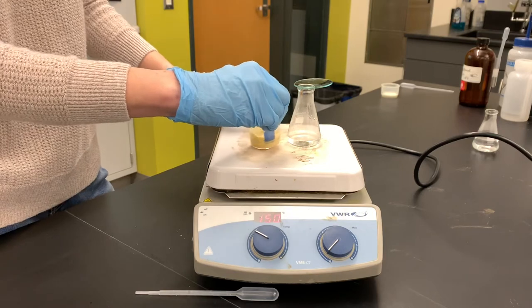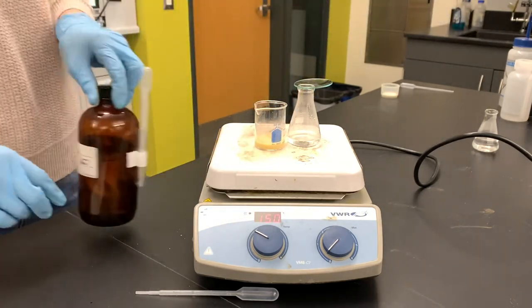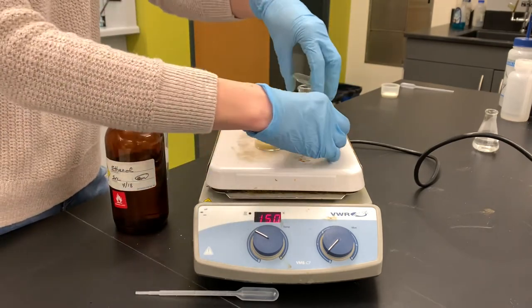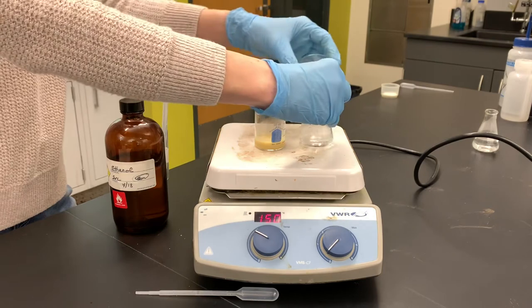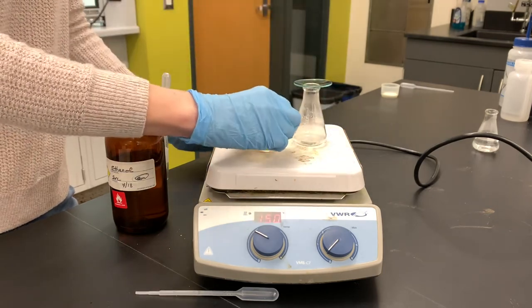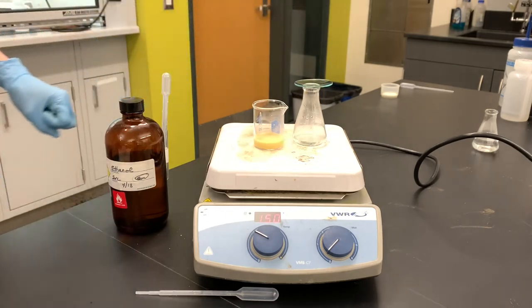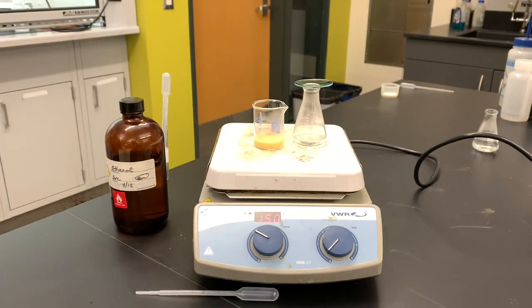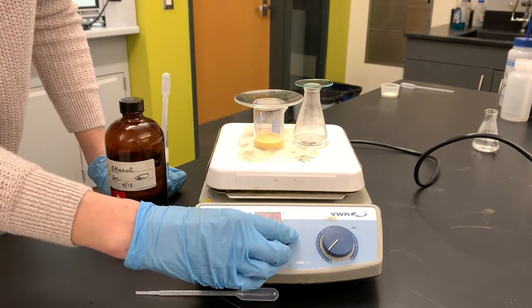I might have to make some more ethanol mixture for this. So I'm going to be ready just in case I need a little bit more of the ethanol. I don't want to make any kind of decisions yet because nothing is boiling, and you always want to make sure that everything is boiling before you decide to add more solvent. Cover that up to keep it from evaporating, and we'll let this heat up.